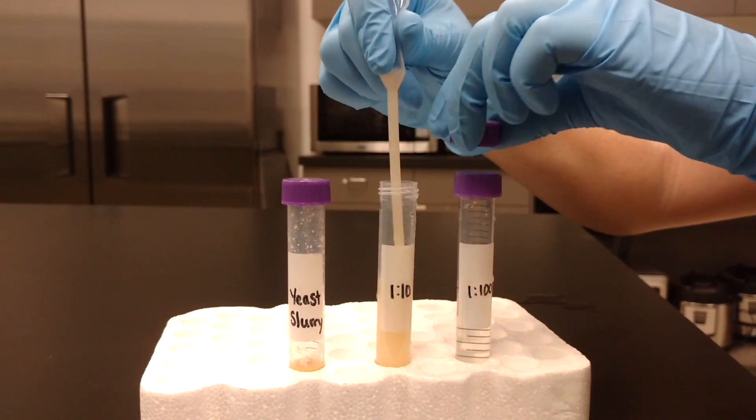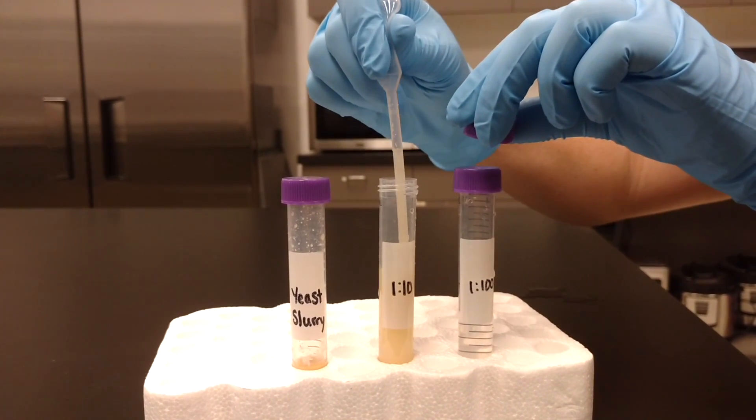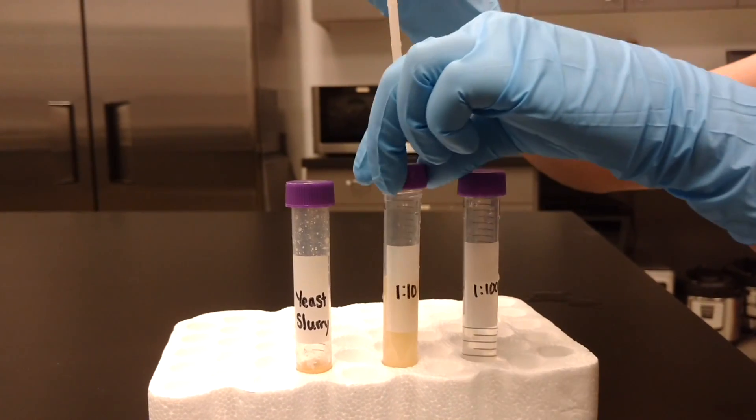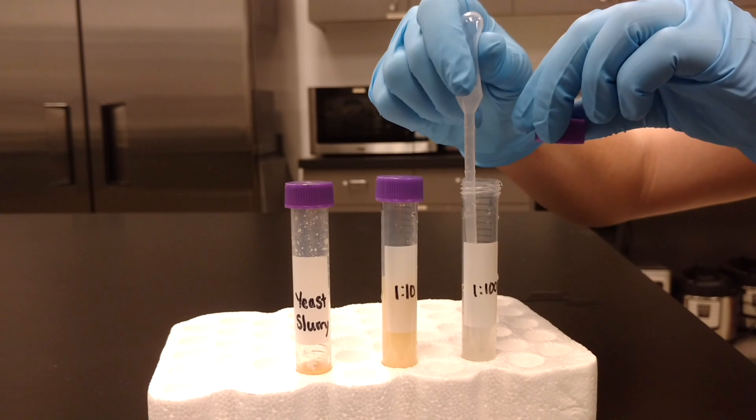Pump the pipette to mix up the yeast and water. Using the same pipette, remove 1 mL of diluted yeast and place into the next water tube. This will make a 1-to-100 dilution. Continue with more water tubes if further dilution is necessary.